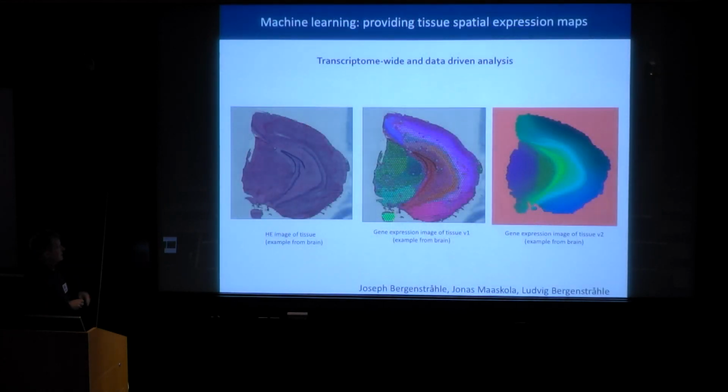And this is just a demonstration of part of the brain. These are the most recent arrays from 10x, which you can see are much denser. And by computational means, spinning out from the bioRxiv of the probabilistic methods that we're using, the data looks something like this today, which is looking very nice, I would say.